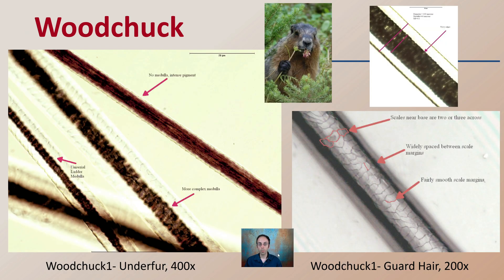Looking at the woodchuck — the underfur shows a compilation of hairs with quite a difference. We have a uniserial lateral medulla, a more complicated medulla, and one area with no medulla due to intense pigmentation. Keeping in mind where you're sampling the hair might require looking at different regions of the individual. Looking at the scales near the base, note the wide shape between the scale margins and the fairly smooth scale margins. The diameter of the hair to the medulla can help us define the medullary index.